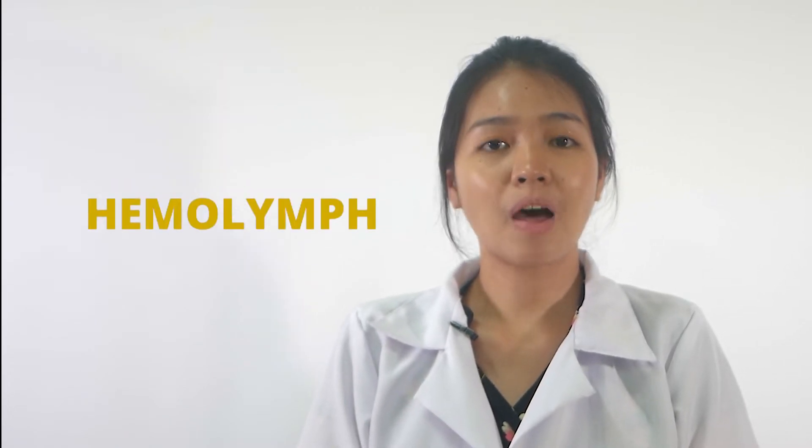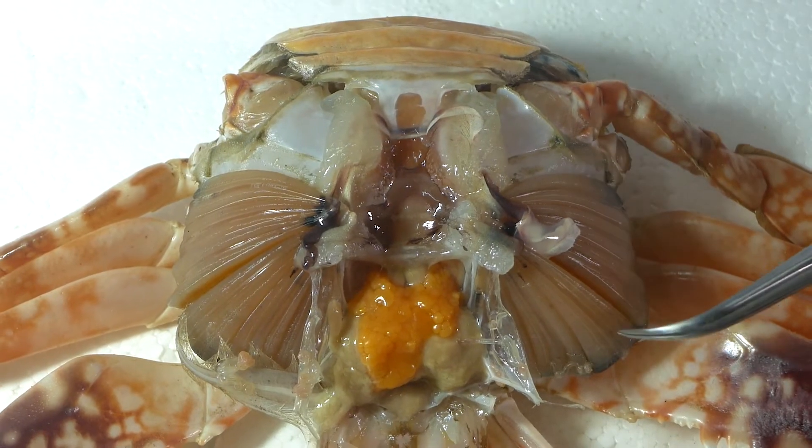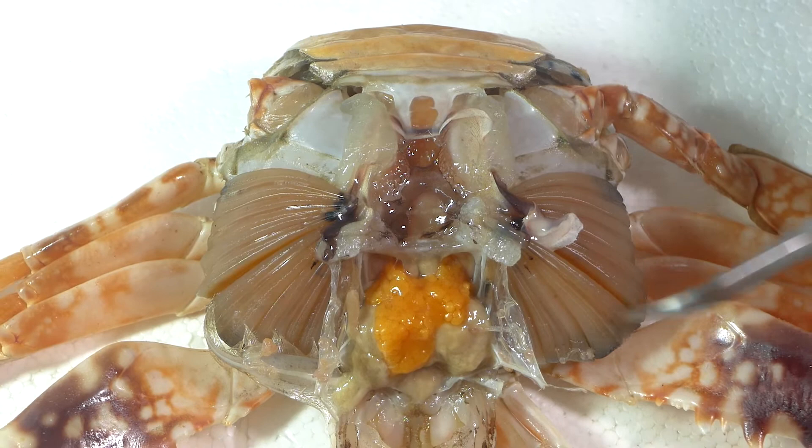Crustaceans have an open circulatory system with a fluid called hemolymph, which is analogous to the blood in vertebrates. These structures here are the gills.